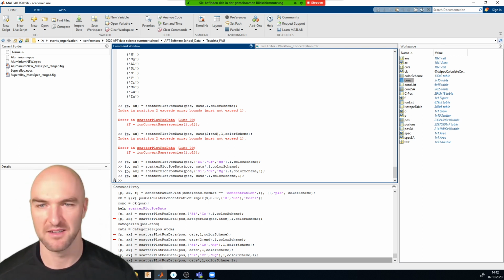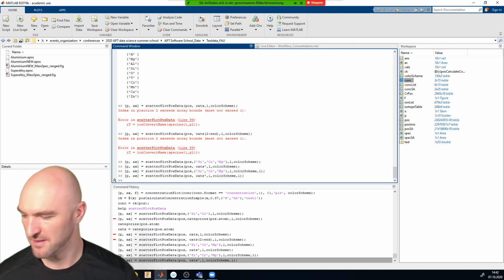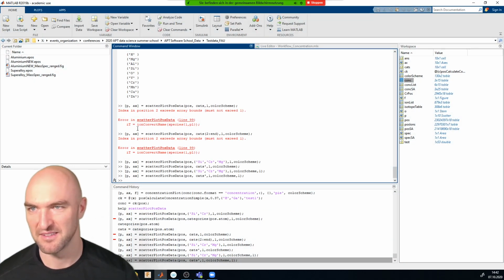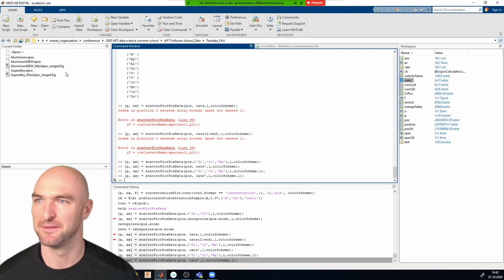Yeah, I'm quite honest. I was already stuck at the point where you load the spectrum from the figure. It seemed almost intuitive to you that you were clicking somewhere in the figure, and I got lost there with bugs. Later, I figured out that you just have to click on the mass spectrum, and you're done. But that got me quite a bit behind.